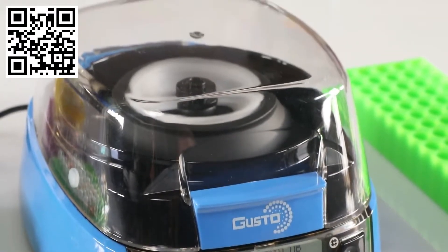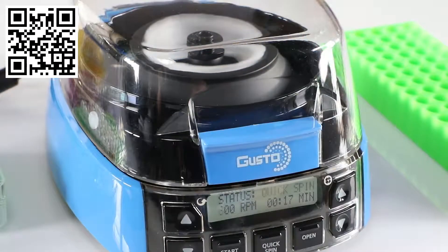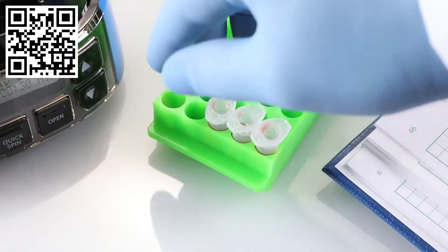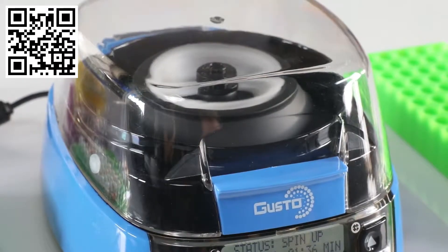For duplicate spins, simply reload the rotor and press start. There's also a quick spin option for commonly used 20-second cycles. An ideal solution for PCR, micro filter, cell separation, and HPLC protocols.